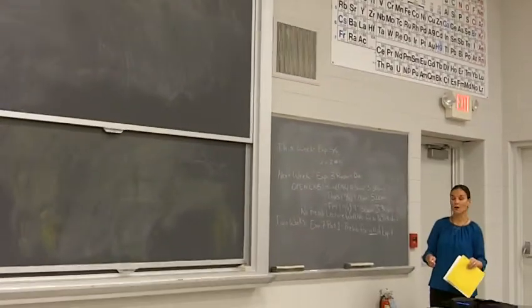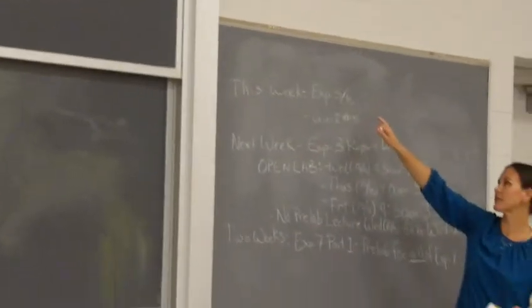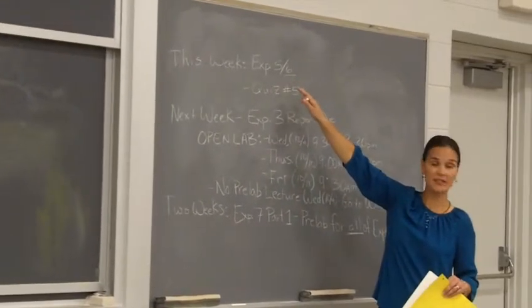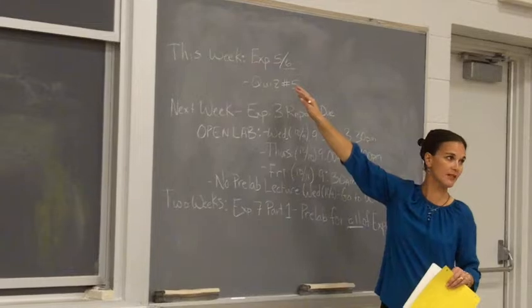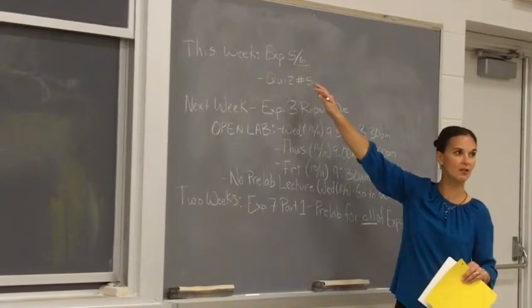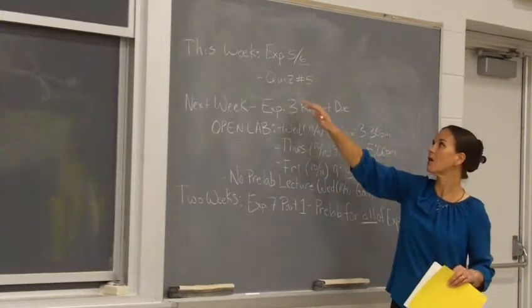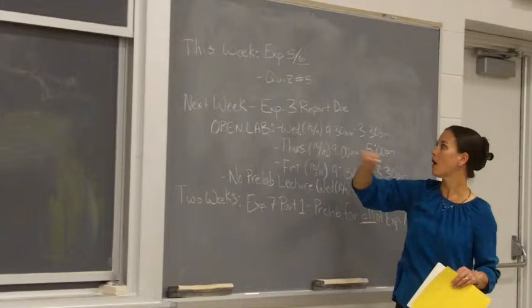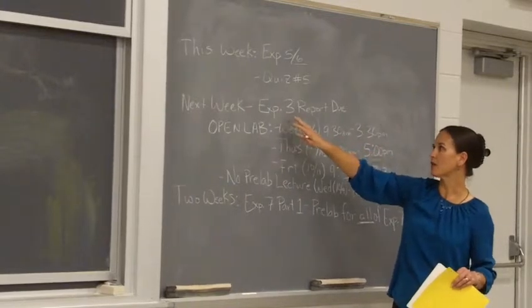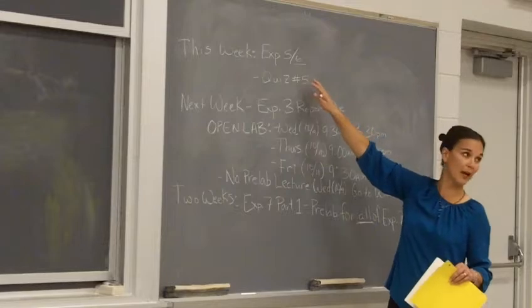Announcements for this week. In lab this week, we will be doing experiment 6. On your syllabus, it also says experiment 5, which is information about the technique you're going to learn. You're going to learn how to use IR spectroscopy this week. You'll have your quiz.